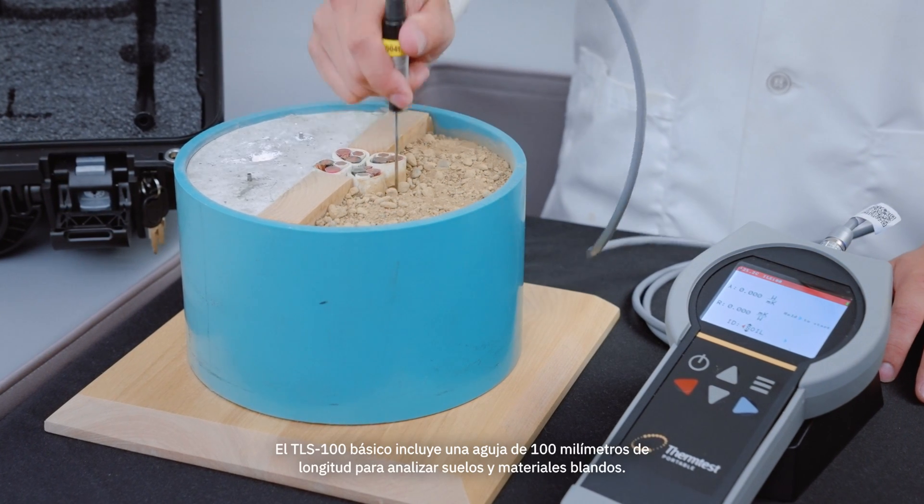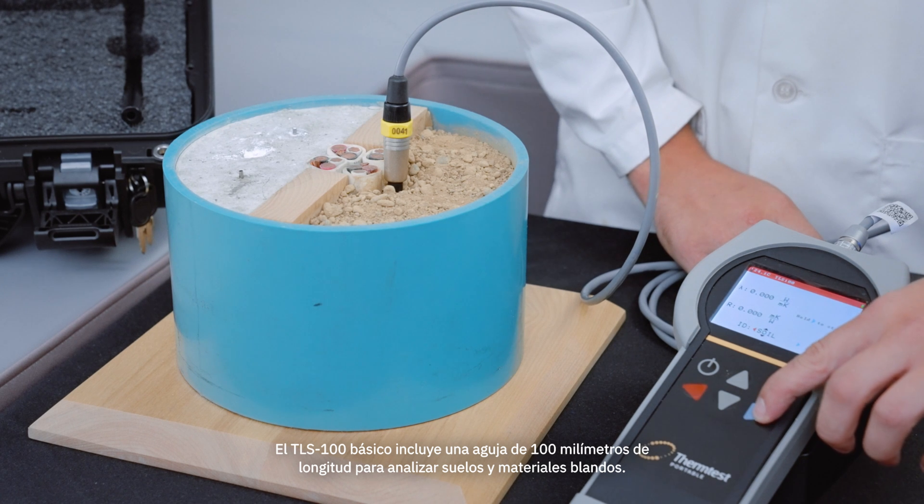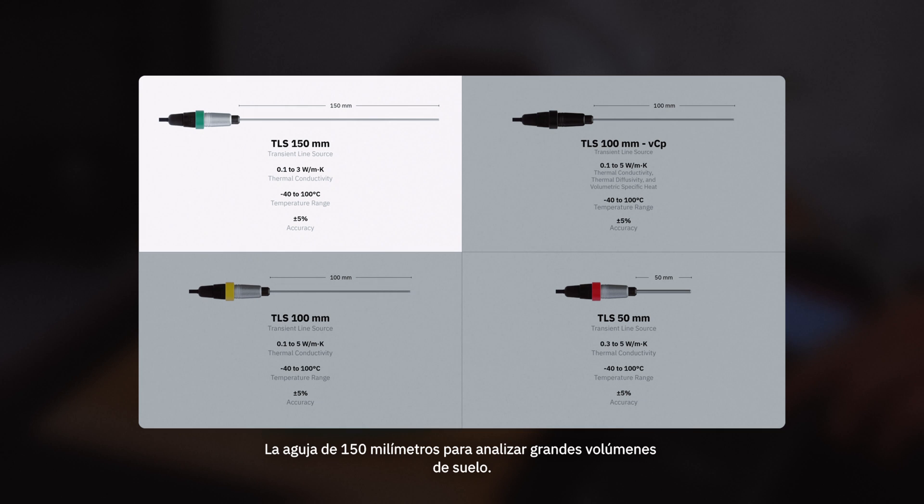The basic TLS100 includes a 100mm length needle for testing soil and soft materials. Several additional sensors were designed and are available for expanded applications, including the 150mm needle for testing large volumes of soil.